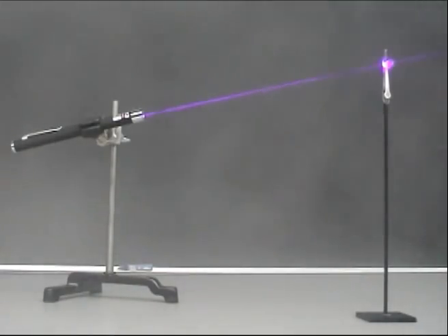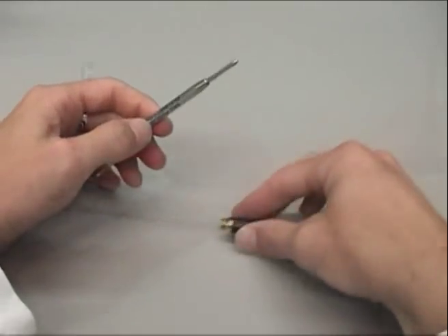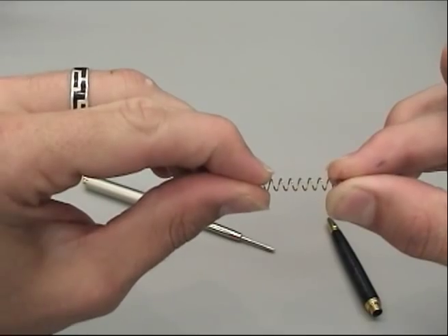In our experiment, we will be using visible light, which has a longer wavelength than X-rays. And we'll be imaging something much larger, a small helical spring, like the type you might get out of a pen.